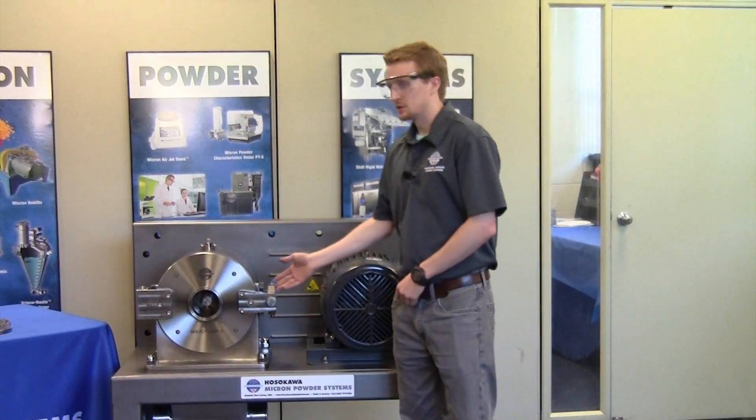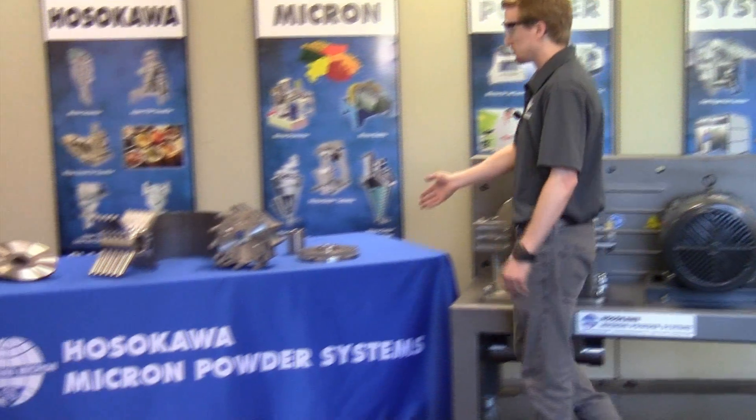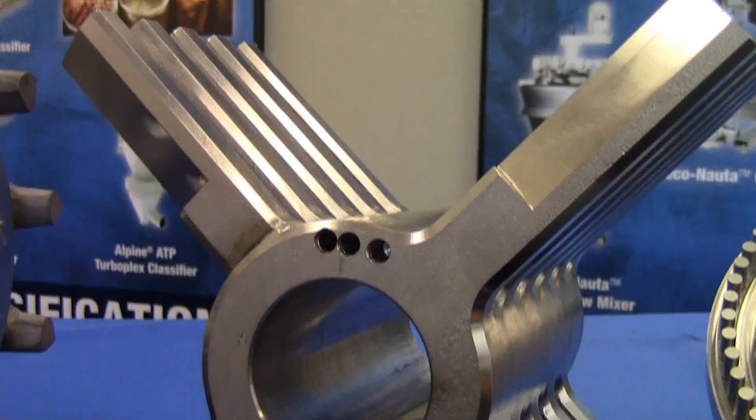The Micro UMP2 is a mid-scale production unit with our universal milling system. It's available with these four rotor types: the pin rotor, LFS hammers, and rigid knife rotor.